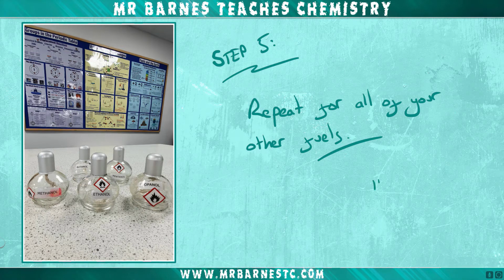And then finally, step 5, you need to repeat these steps with all of your other alcohols, and if you have time, repeat each alcohol. By repeating, you get to remove any anomalies, any results that don't fit the pattern.